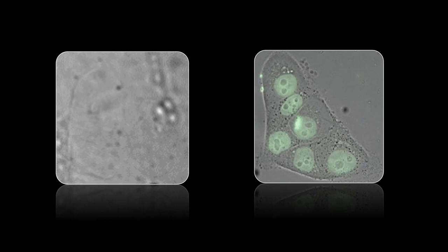Usually, researchers have only two options: label the sample with dyes, which may alter the cell structure, or use a phase-sensitive microscope.